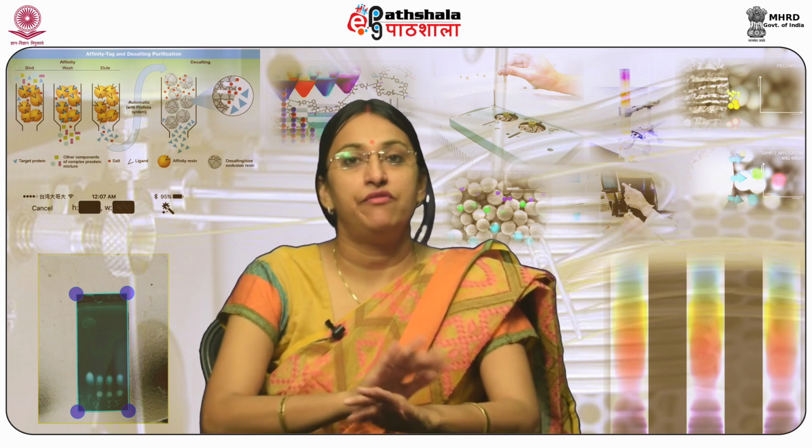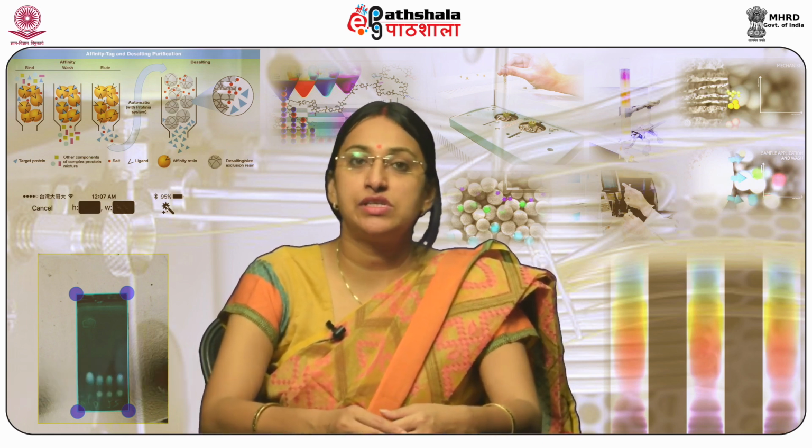Types of solvent mixing processes. The mixing of solvents to prepare appropriate mobile phase can be done in any of the three ways. Firstly, manual mixing. It is the simplest way of mixing solvents in a precise manner without using the pump. Low pressure mixing. This is done by using a single pump with a proportionating valve to deliver the solvent. And high pressure mixing. In this system, two pumps are used to push the solvent separately and the output liquids are blended by online mixing.